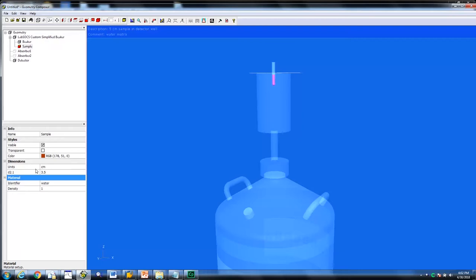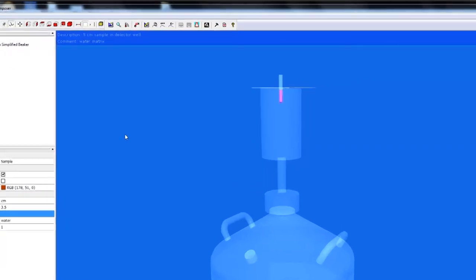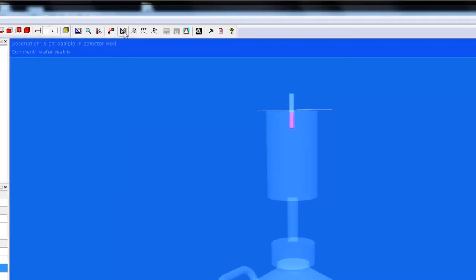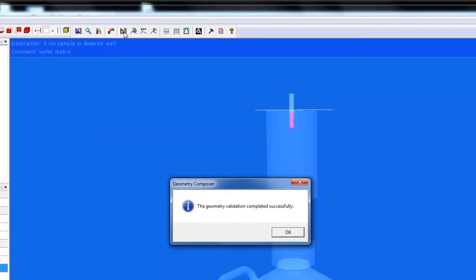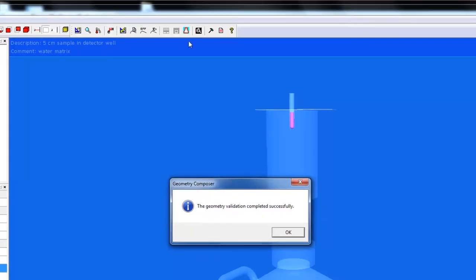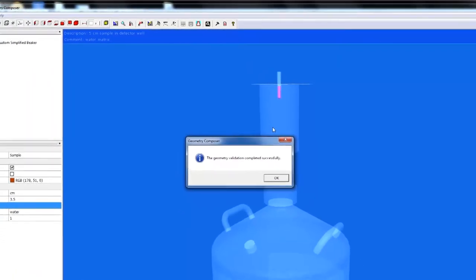To validate that everything entered was successful, click on the validate geometry icon. A pop-up will display the text, the geometry validation completed successfully, if it is successful.